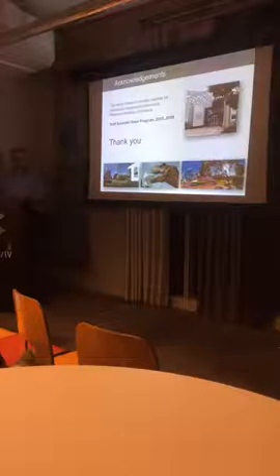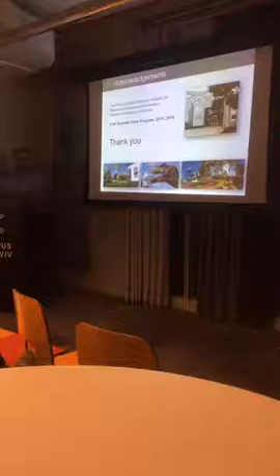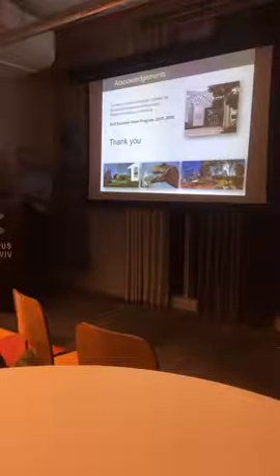MATLAB can do it as well, or for example it could be done in LabVIEW. What is good in LabVIEW, it's not open source, but LabVIEW can do it on the fly. So I can acquire an image and immediately process it, and you have an image in real time.